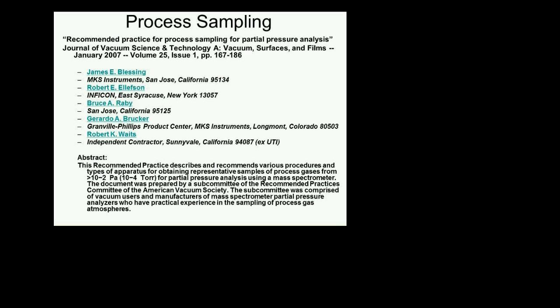And you want to know what the gas composition in that system is. What you're going to have to do in that case is develop a system that is a little more complicated, that is a process sampler. Okay? So this is what I want to tell you.